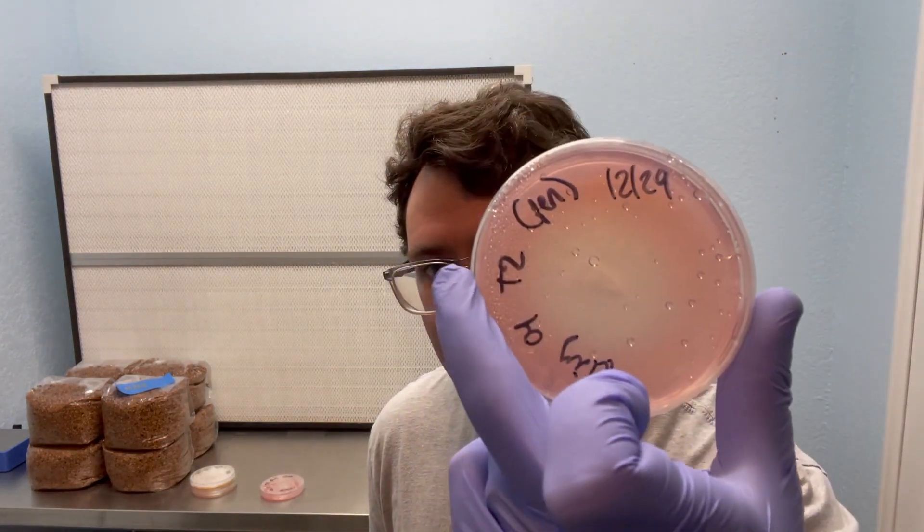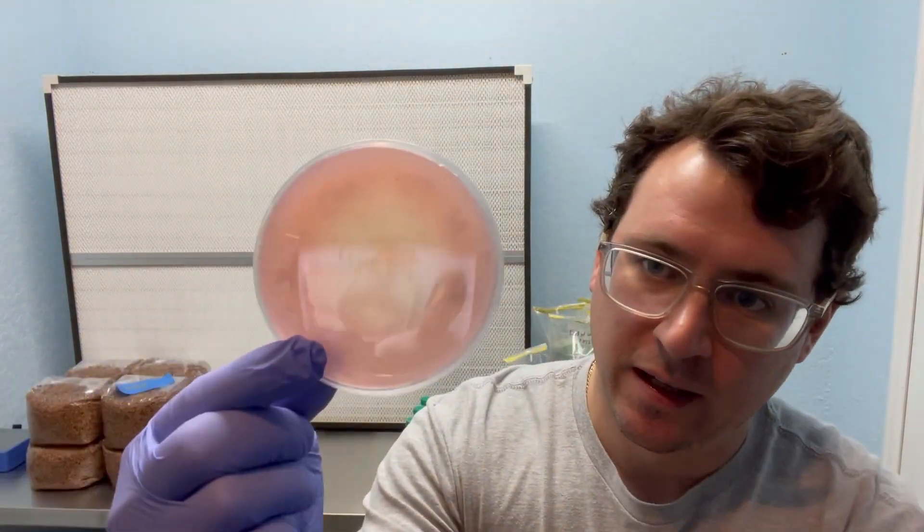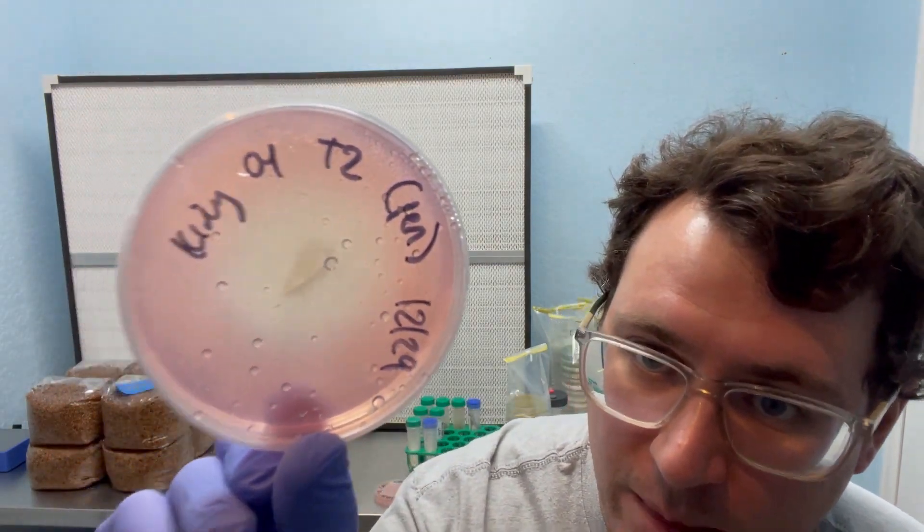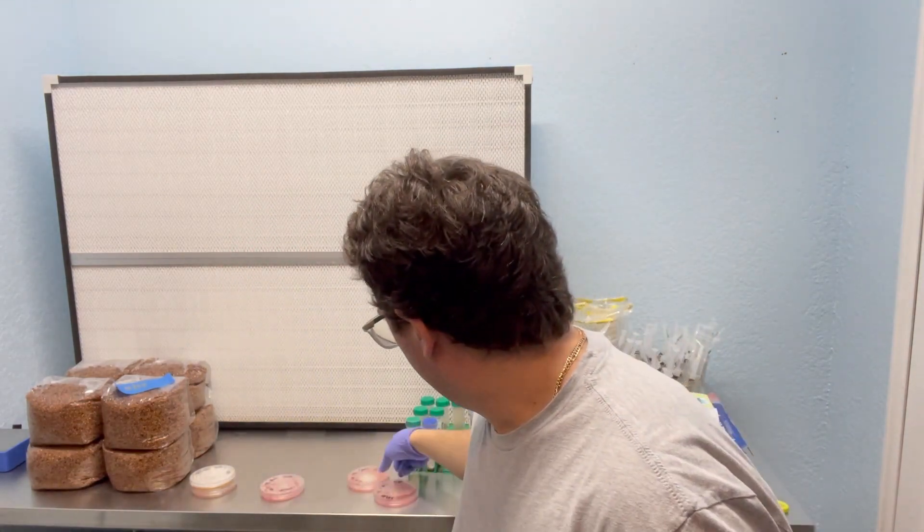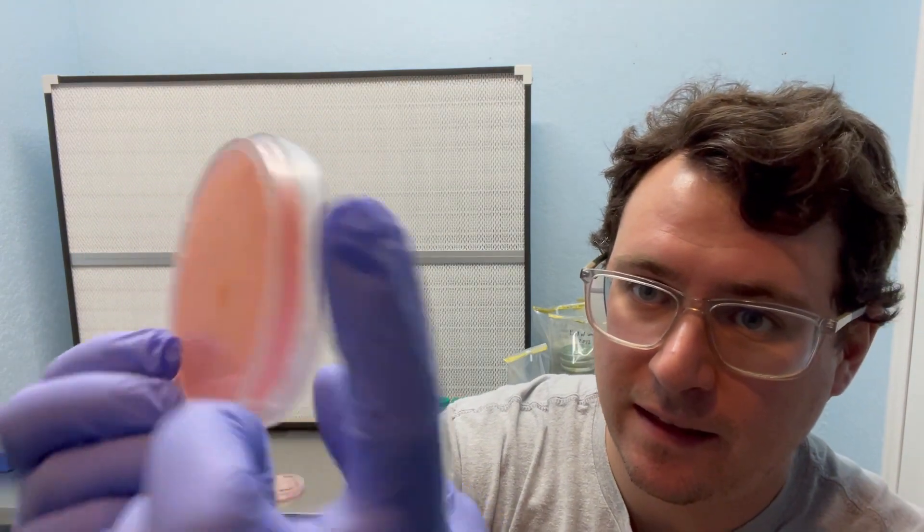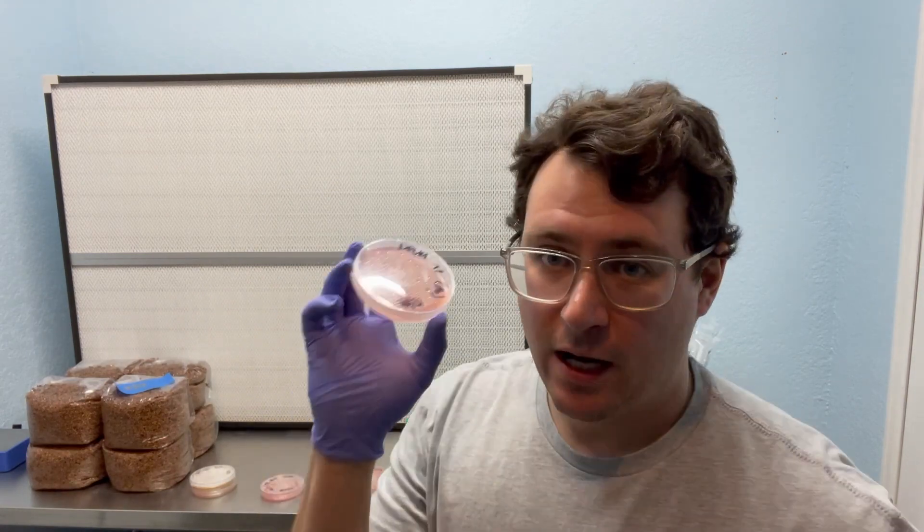All right everyone, it's been five days since I transferred and I've got a really nice looking king oyster. So this is the ideal plate that I like to work with. It's got growth almost up to the edge. Very clean, healthy mycelium. So that was the king oyster transfer. And now, if you take a look at that lion's mane, you can see there's still a culture near the edge. So even though I tried my hardest, I still transferred a little bit of that penicillium mold. And there's a couple options.